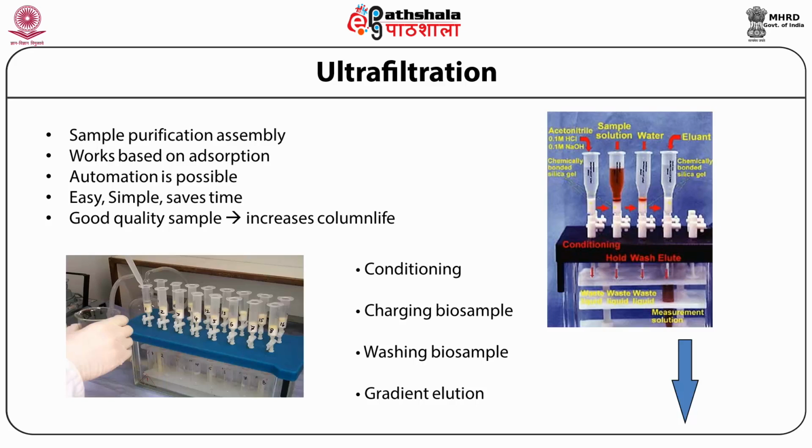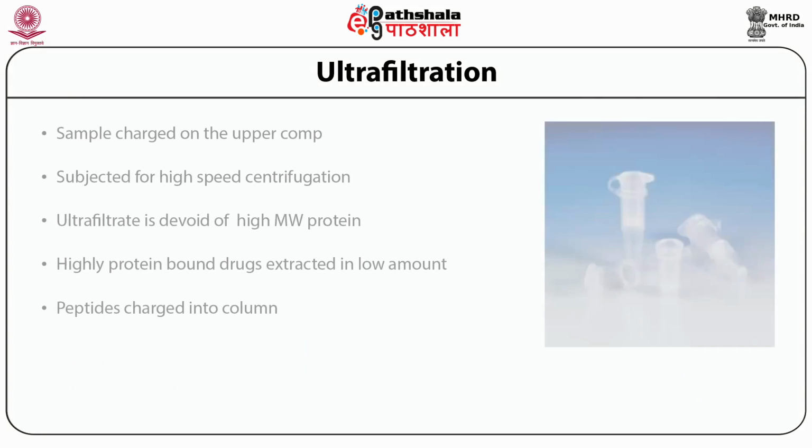After that you apply suction to dry the column. Now you change the tube and you add only pure methanol, which elutes the bound molecules of your interest into the tube. Thereby you get a semi-purified sample which can be subsequently used for your analytical separations.